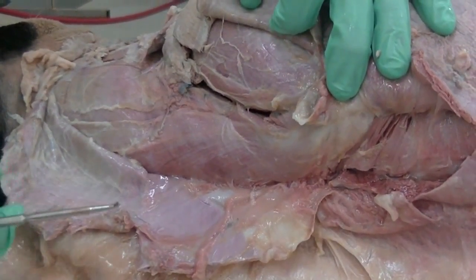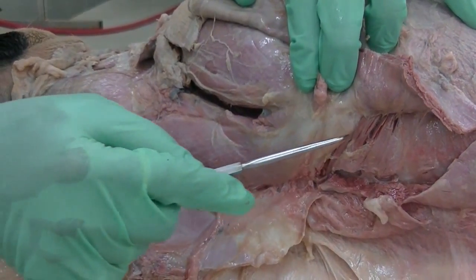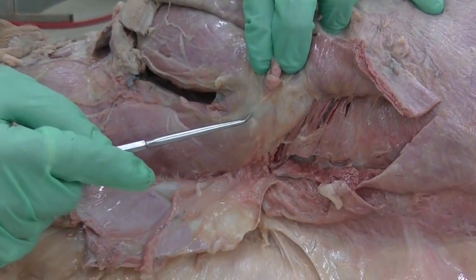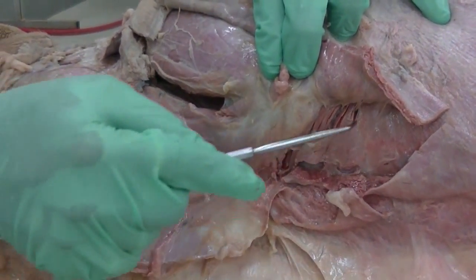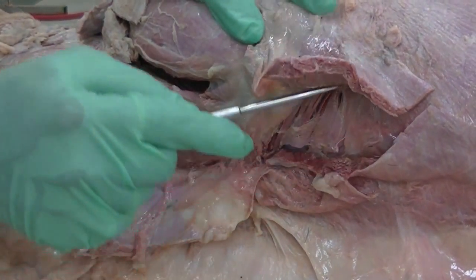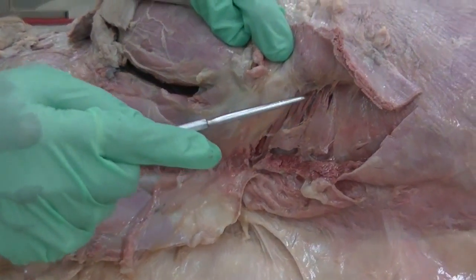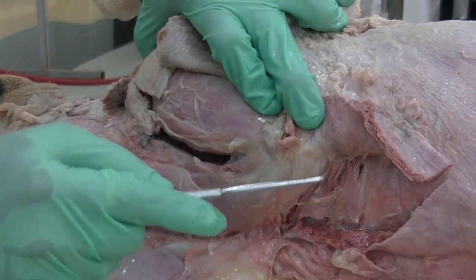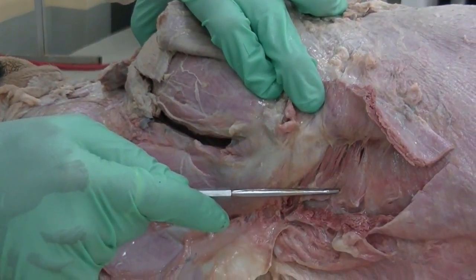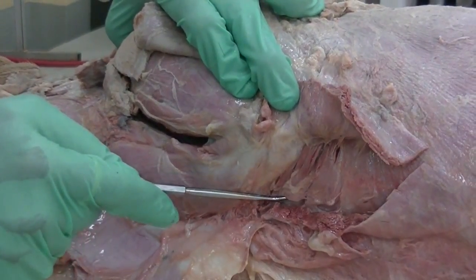also reflecting the cut portion of the cleidocervicalis in order to expose another extrinsic muscle of the forelimb, which is attached to the dorsal border of the scapula on its medial side. Part of the muscle actually is attached to the thoracic region. We see the cut portion of the trapezius, and the muscle underneath the trapezius is the rhomboideus. This part is associated with the thoracic region, so it is rhomboideus thoracis.